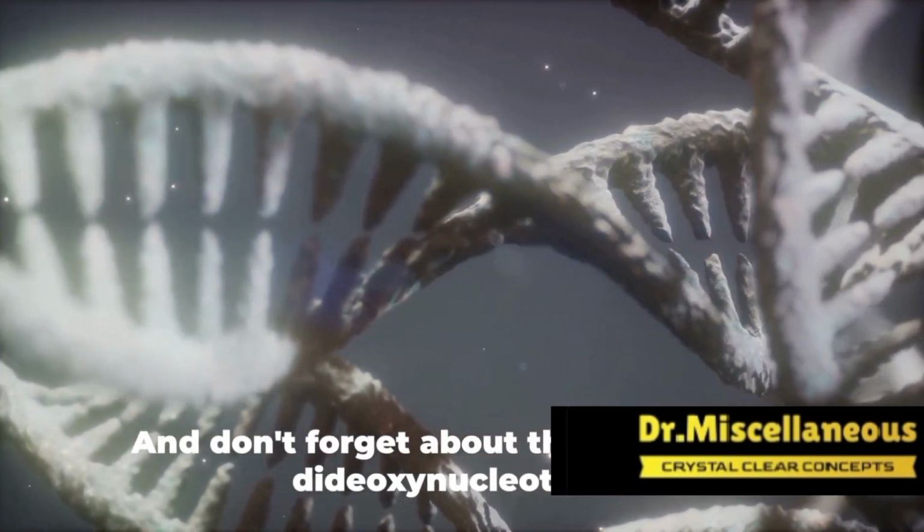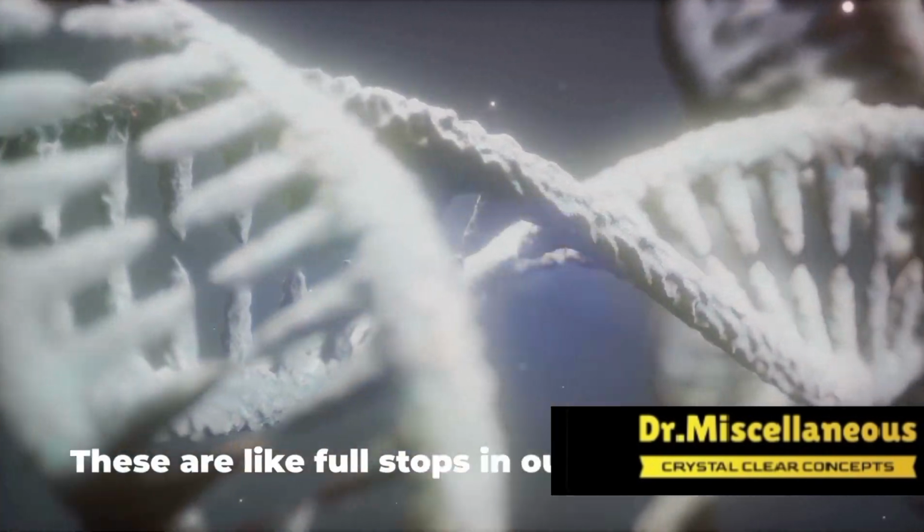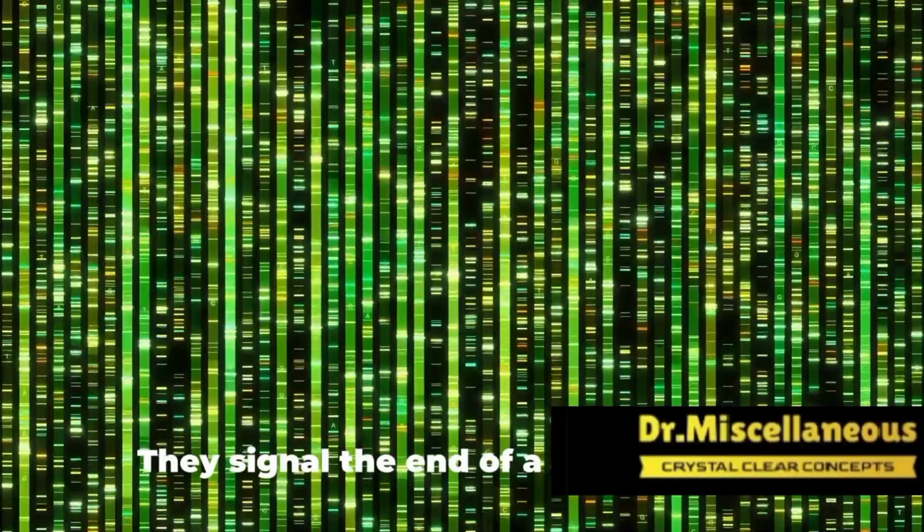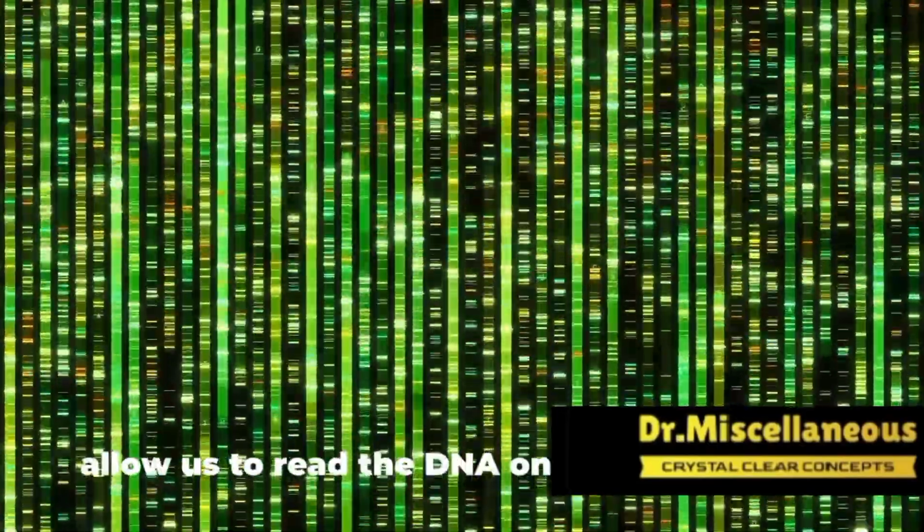And don't forget about the terminating dideoxynucleotides. These are like full stops in our DNA sentences. They signal the end of a sequence and allow us to read the DNA one letter at a time.